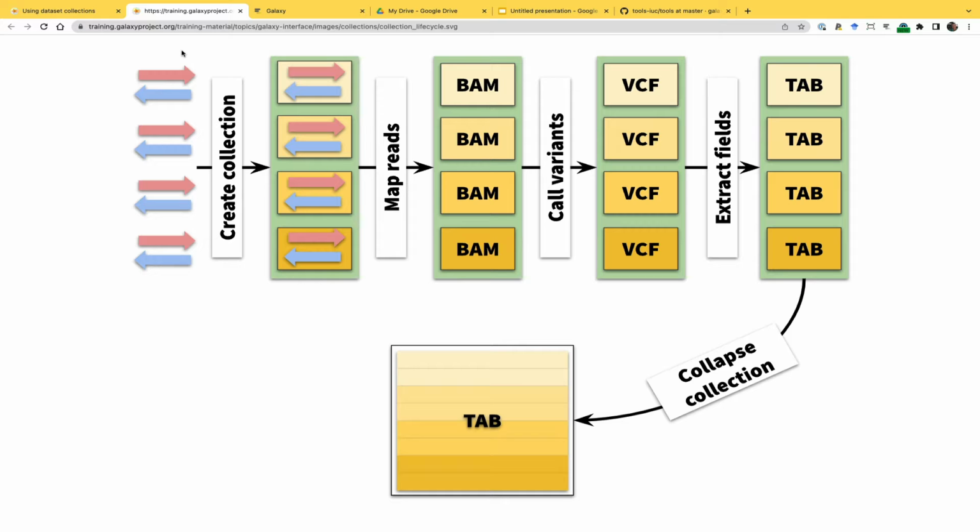First of all, sequencing is getting relatively cheap. Plus, with one sample, what can you really do? Well, in genome sequencing, one sample is good enough when you want to sequence a particular genome. But even then, it's better if you sequence trios. If you're doing RNA-seq, one sample is never enough, because you always need replicates and so forth. So at the end of the day, you get your data from the sequencing center, and you get back a bunch of files under OneDrive. And then everything stops.